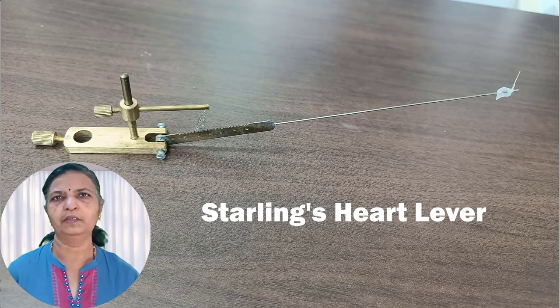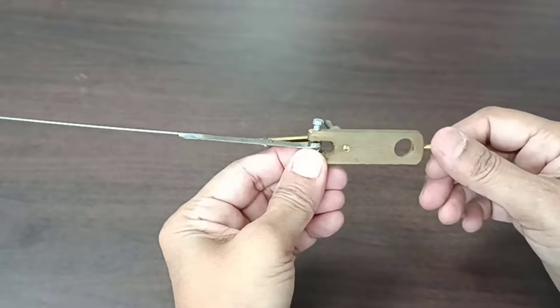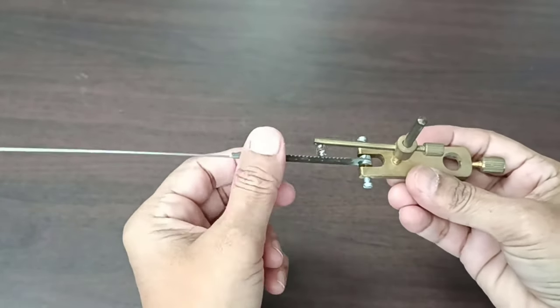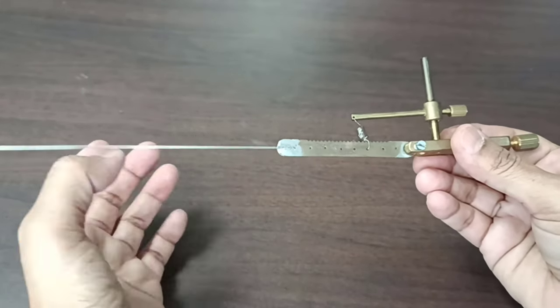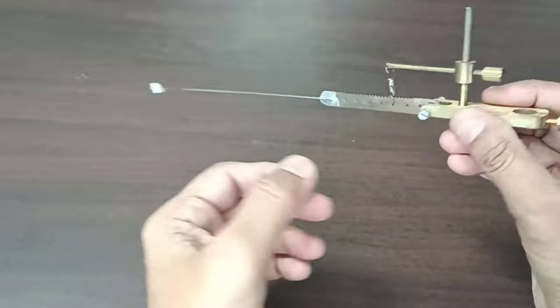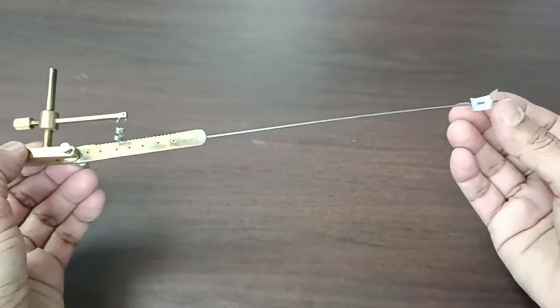First we shall learn about Starling's heart lever, which is an essential instrument in cardiac muscle experiments. It is a simple lever system which has a standard size holder along with a screw at one end, helping to fix the lever at a desirable position. The other end has a lever system — the short arm is a thin lightweight metal plate, freely movable at its junction with the thick plate. This point is the fulcrum. The other end has a thin long lightweight rod acting as the long arm, with a lightweight plastic pointer attached to its end which records the amplified movement on the kymograph.